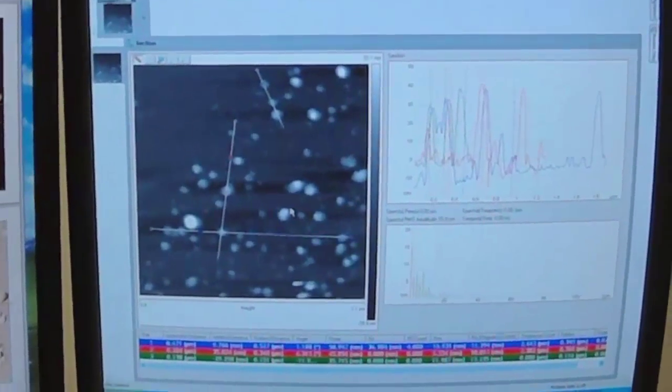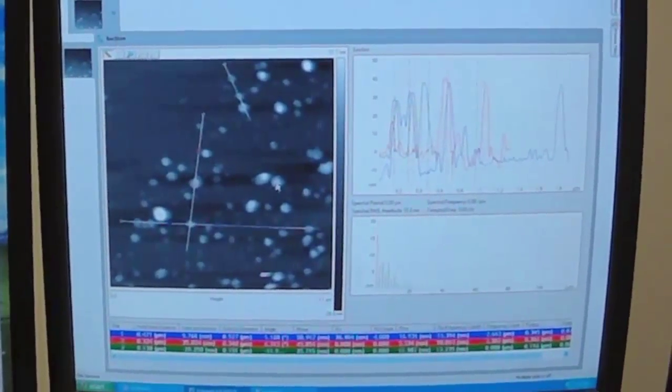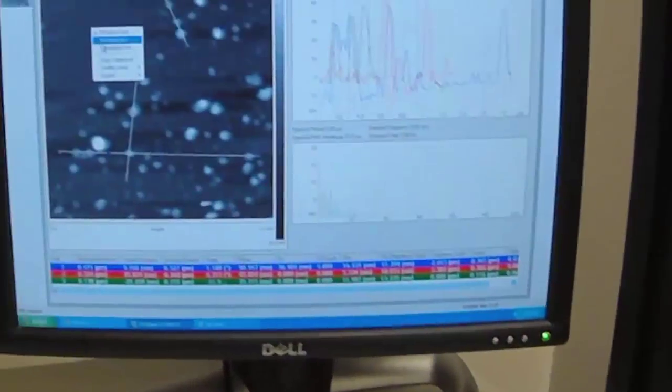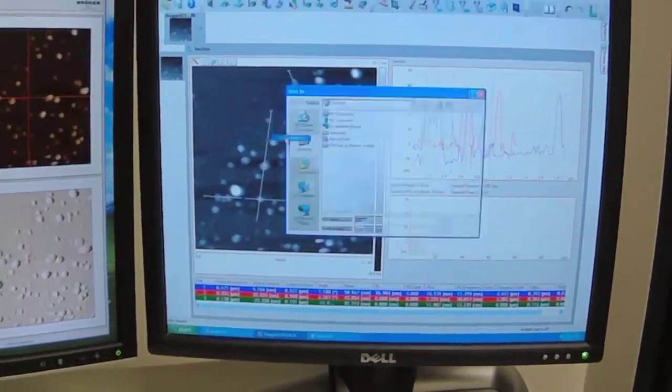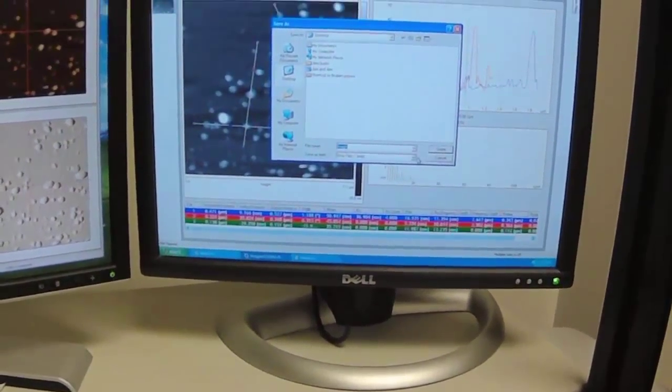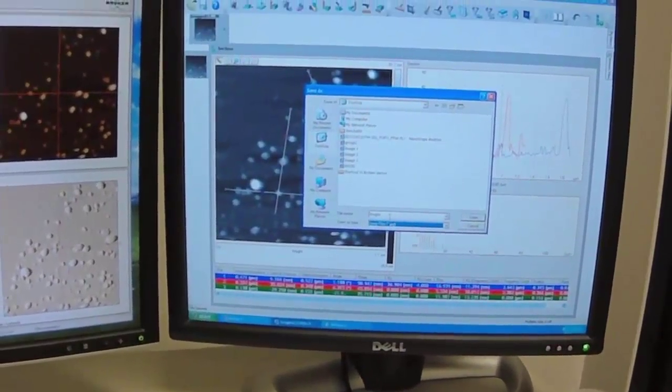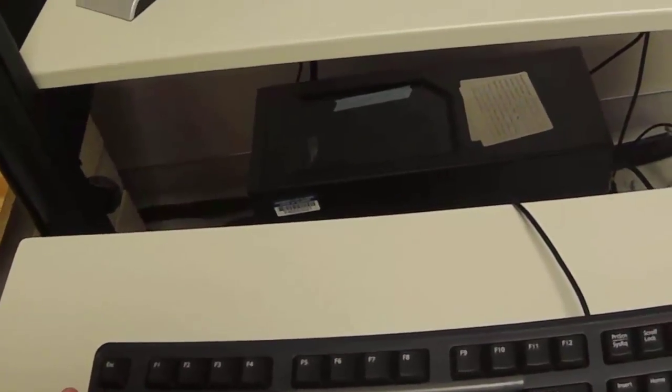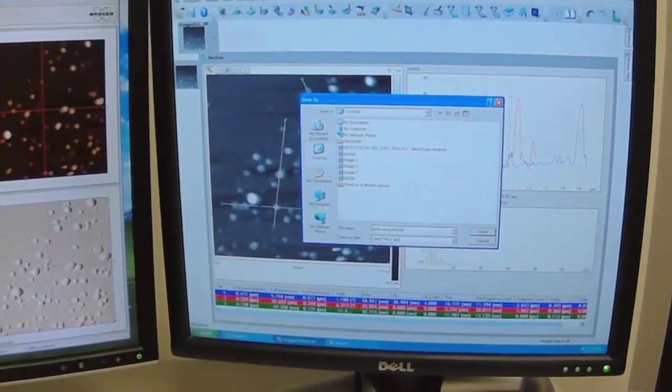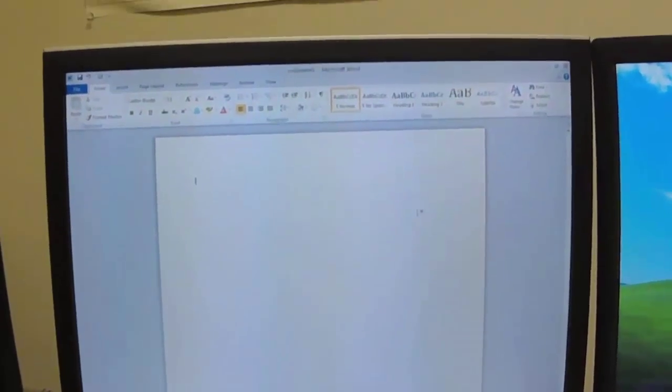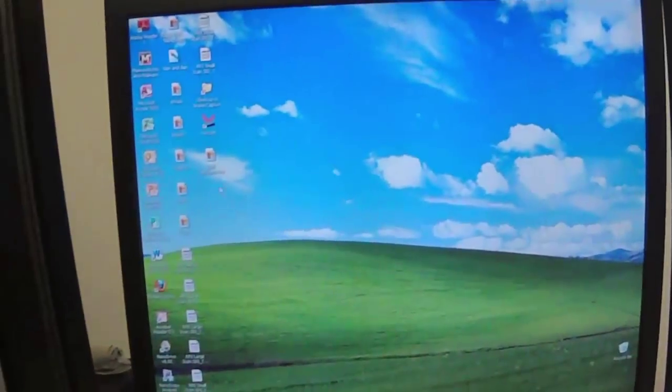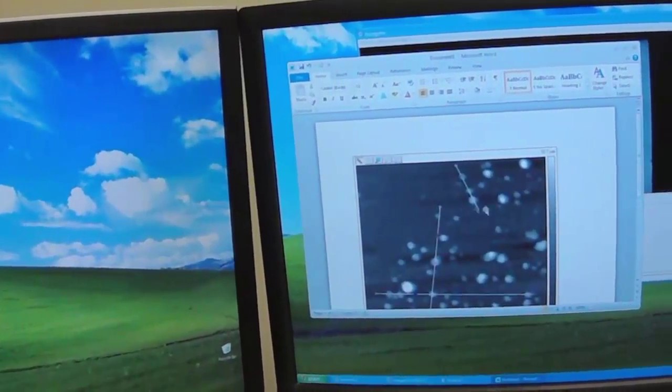If you want to save this image, and this image might be very useful because it shows not only the particles but how you're measuring them, you right click on the image and you can export the image here. JPEG is probably easier to work with in Word. And so this is my old nanoparticles. Import it into a Word document for my lab report.